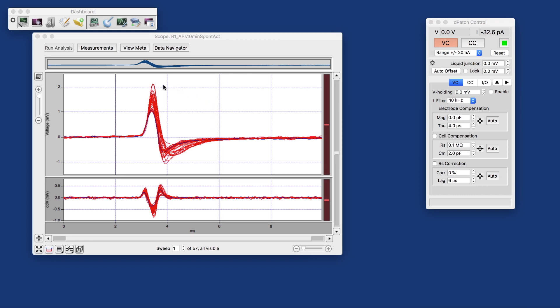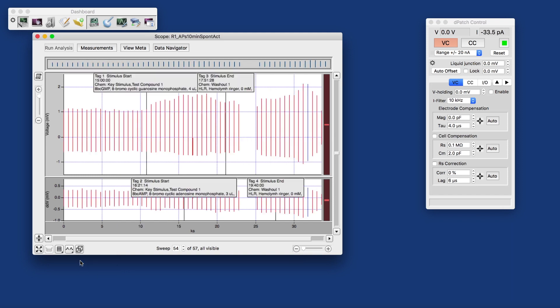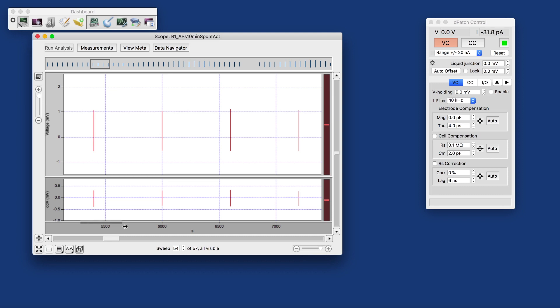What we see here is a dataset of action potentials that were extracellularly recorded from an insect sensillum. What looks like an individual action potential here — each sweep is actually the average of all action potentials during a total of 10 minutes. That means if you look at each sweep here, 10 milliseconds in duration on a continuous time axis, we would have to zoom in very far in order to see something meaningful.